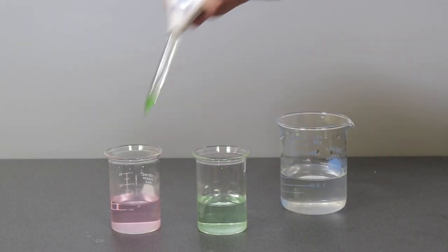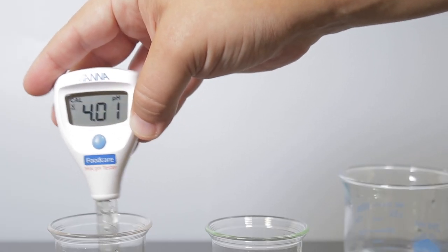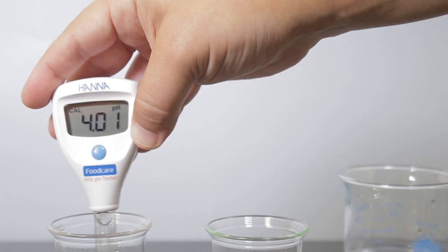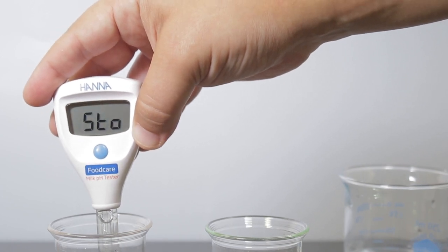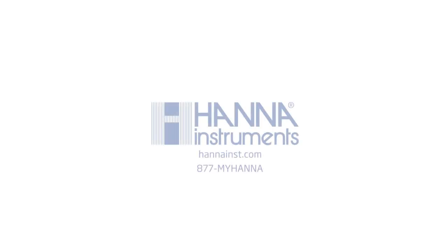Rinse the electrode again and place the tester in your pH 4.01 buffer. Once the second calibration point is stable, 'store' will appear on the screen, confirming that the two points are recorded and it will return to measurement mode.